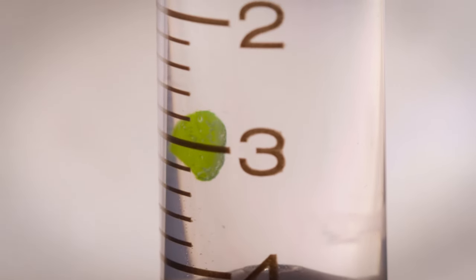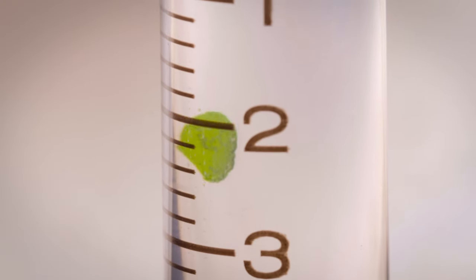I enjoyed watching the experiment — it is tricky but when you've set it up and you're sitting there watching it, actually seeing leaf discs rise as they're supposed to, you see the oxygen bubbles form and the students are all quite excited watching whose leaf disc rises first. It's not often photosynthesis experiments are fun. The pitfalls: keep a close eye on the syringes, make sure they have their goggles on, and do it in the warmer months of the year because temperature has a profound effect on results. Aim for the summer term — photosynthesis practicals tend to work better when it's warmer.